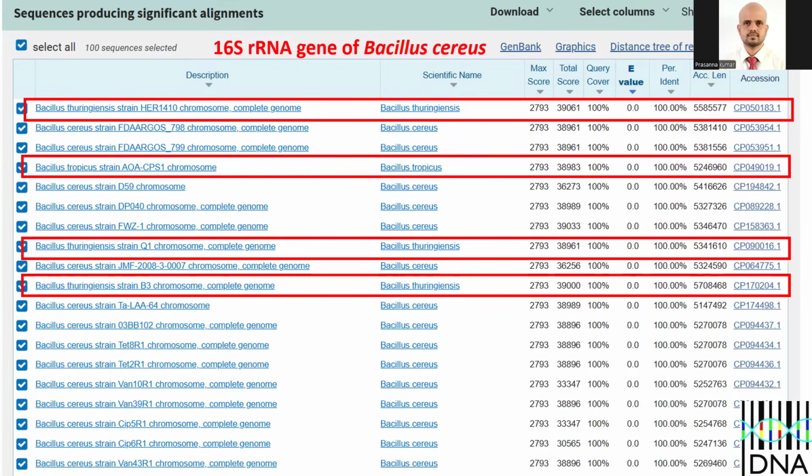That's why multi-locus gene sequencing, because in some species, using a single locus may not be effective. In other words, the speciation is sufficient to recognize them as two different species, but the particular barcode marker we are using to identify them may not have evolved enough.